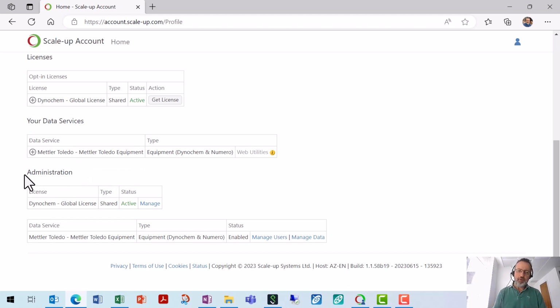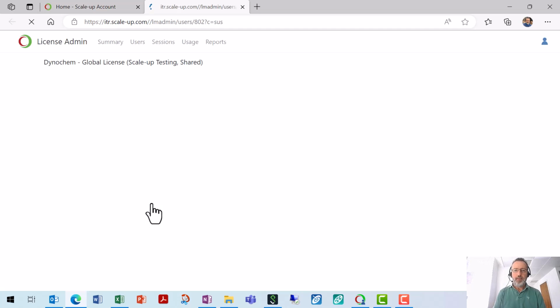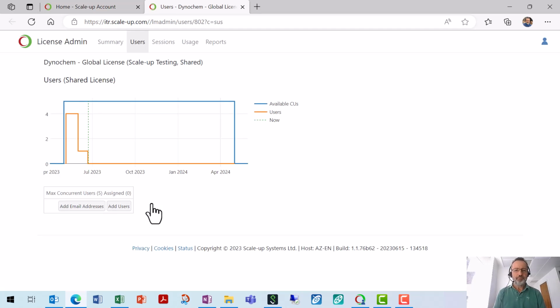So I am, as Joe Smith, I'm the admin for a global Dynochem license, and I'm also an admin for my equipment data service. So I want to show you in this quick movie how to really get the most out of managing either a license or an equipment data service. So I'm going to click on Manage. That's what you should do too if you're following along on a license that you manage.